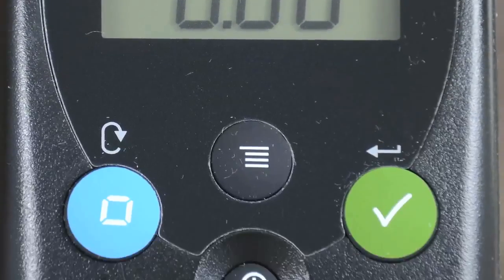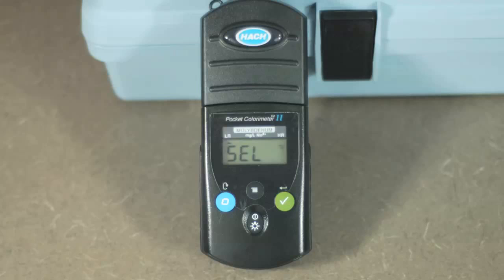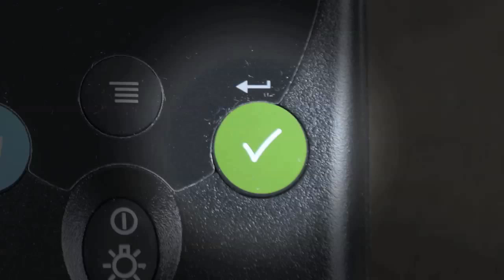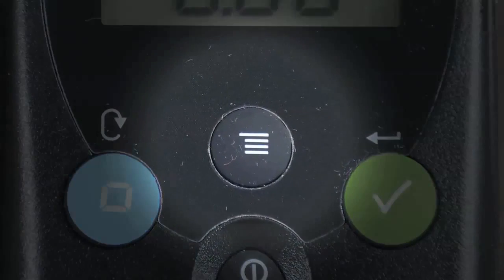If not, press the menu key. The display will show SEL. A flashing arrow indicates the current range. Press the read/enter key to toggle between ranges. Press menu again to accept and exit back to the measurement screen.